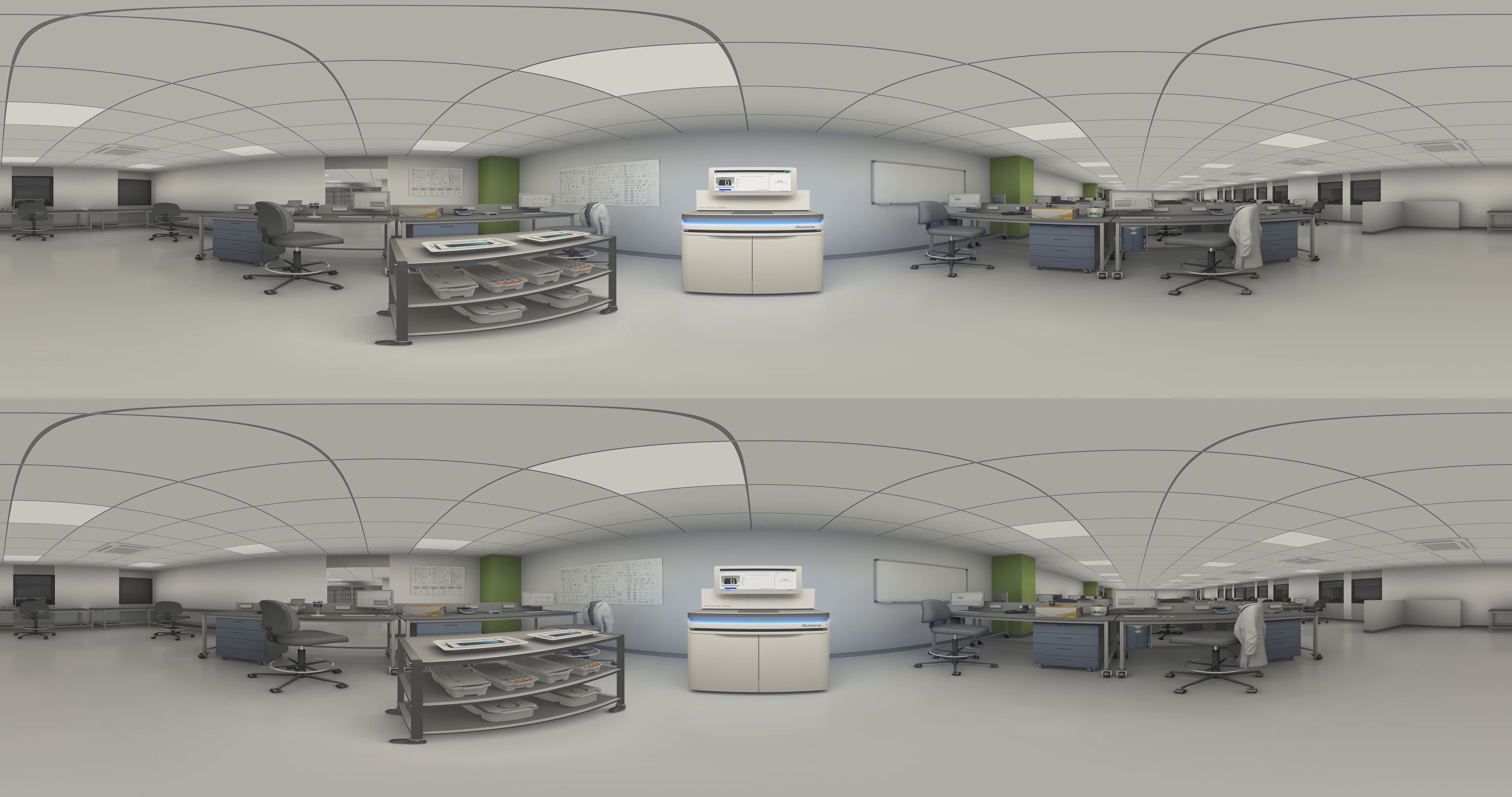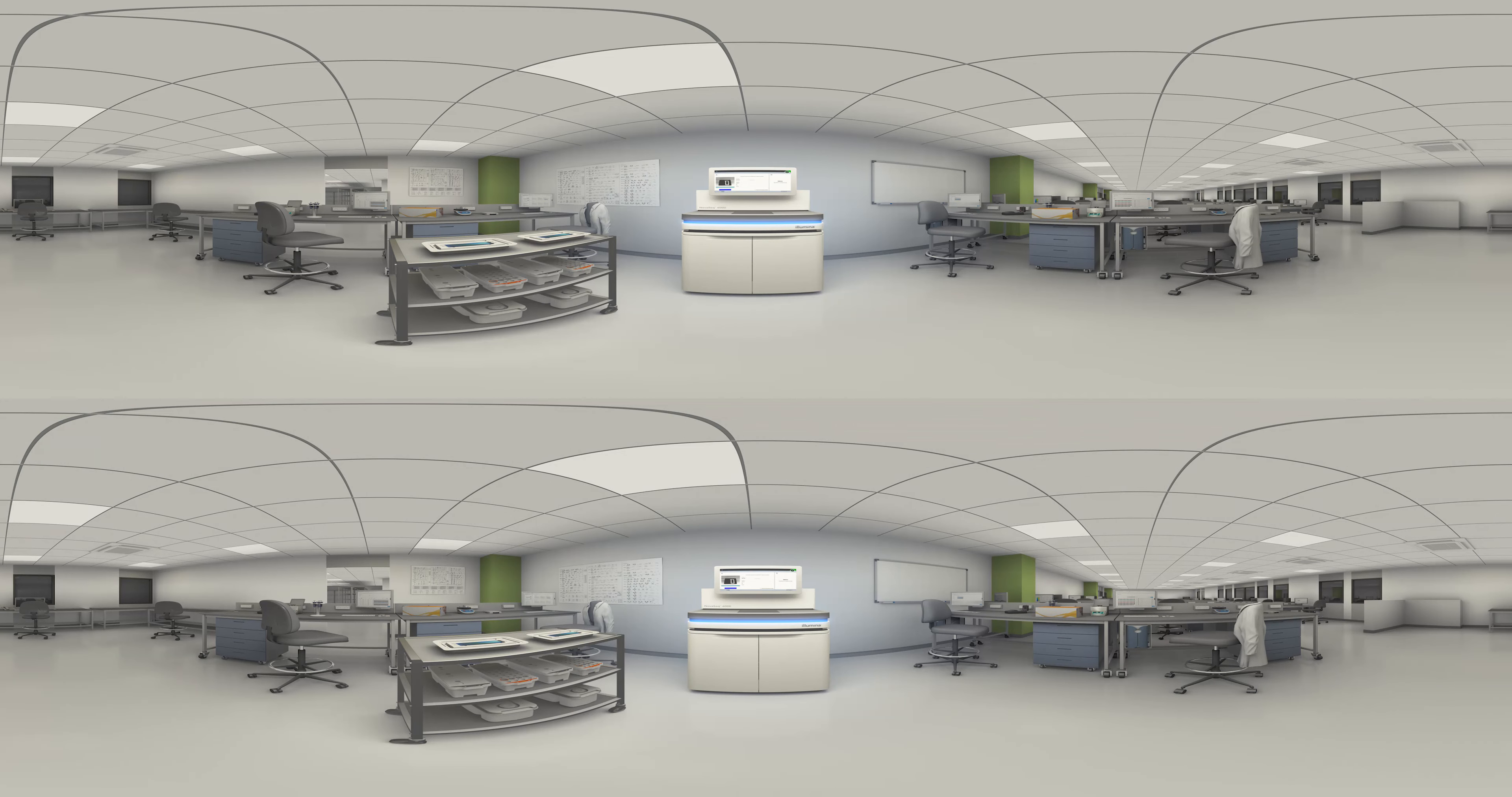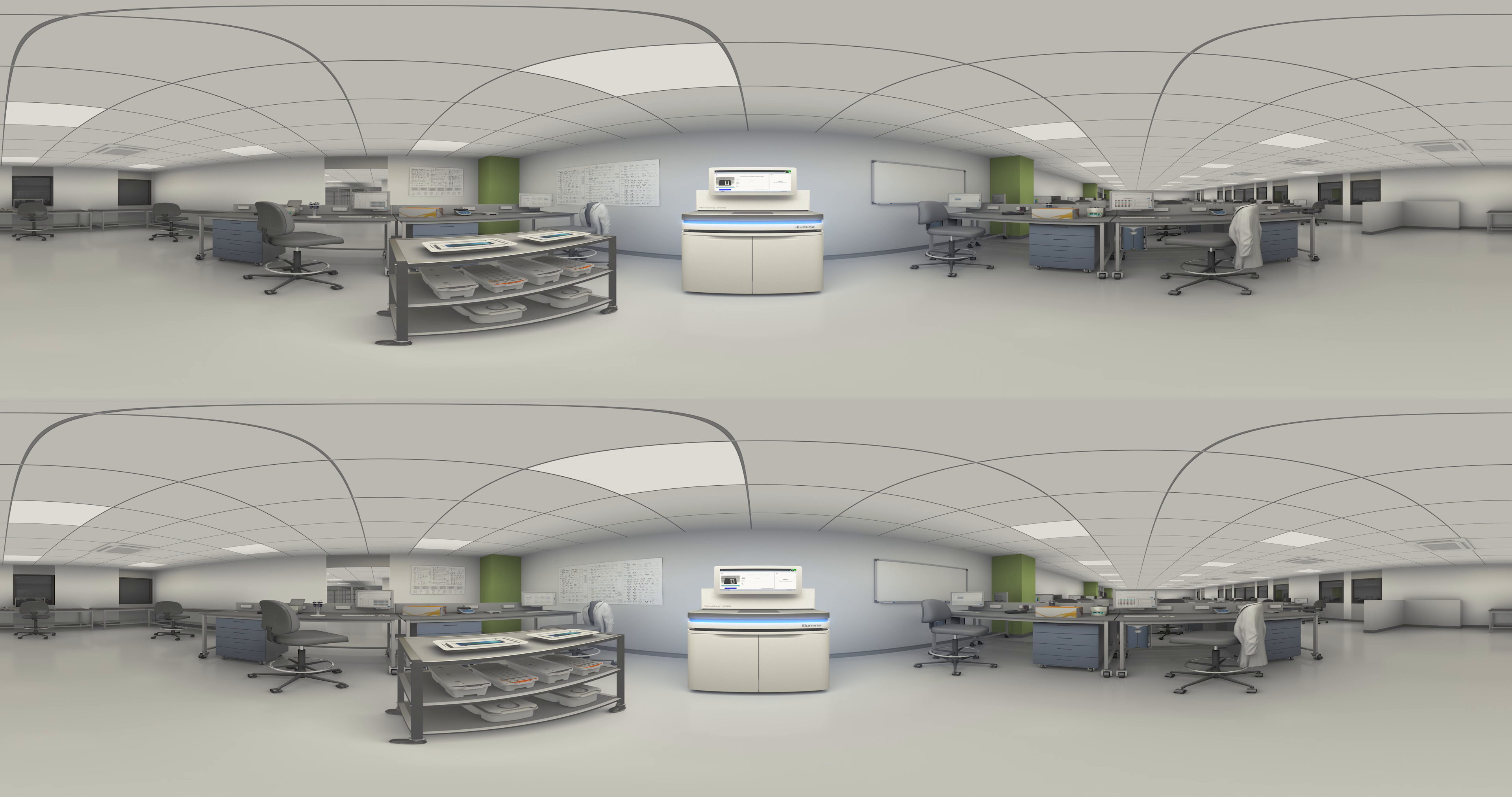The NovaSeq series of systems has arrived. Now get the throughput and flexibility you want for virtually any sequencing method, species and scale.